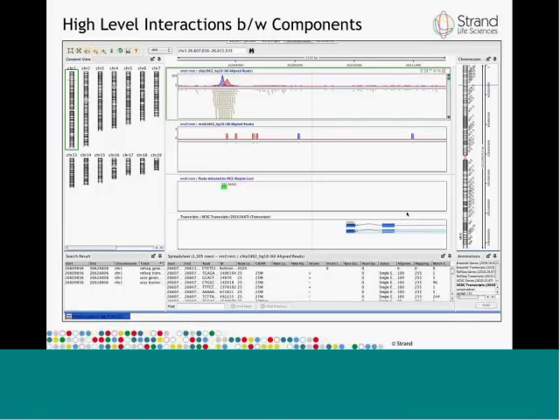Now, just by themselves, if they are static, that would not be of interest. So obviously these different views interact very closely with each other. Let me show you how these interactions are performed.